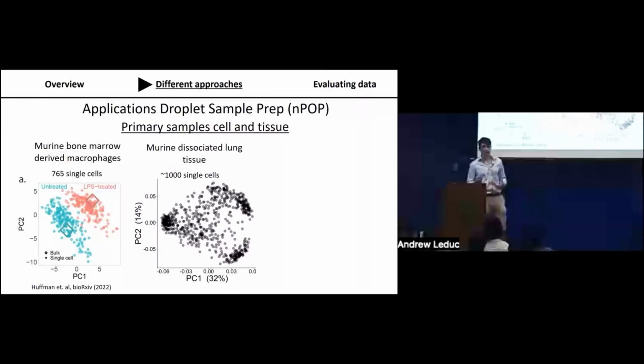But there's also other cases where you're working with more precious samples where this proved to be quite challenging. For example, in some project we're working on now, I didn't annotate this PCA very well, but there's basal cells and ciliated different lung cells. For this project, we were having trouble with the low cell number of freezing the cell samples down. But a lot of the data was collected just by sorting the cells into a PCR tube in PBS and transporting them on ice.